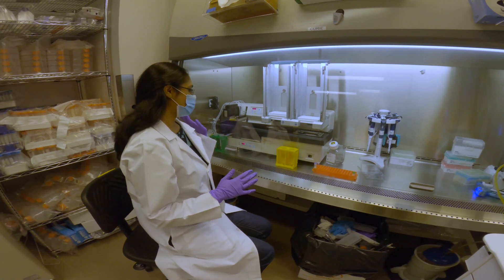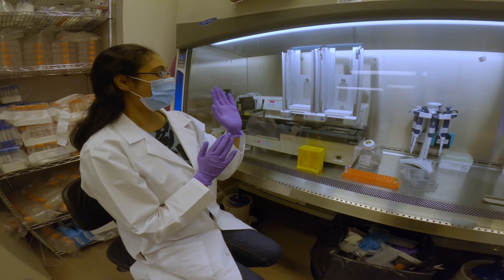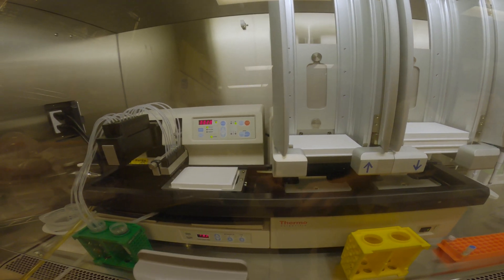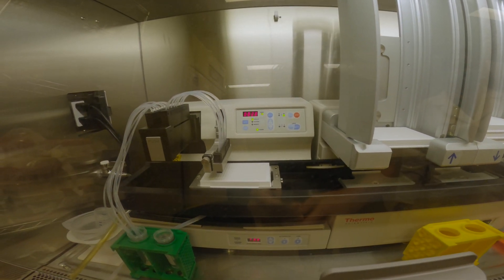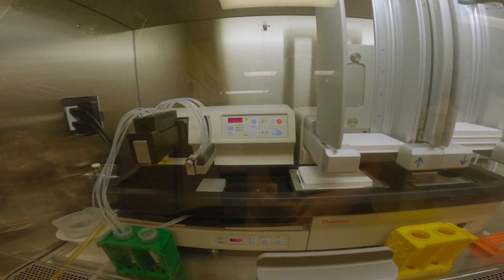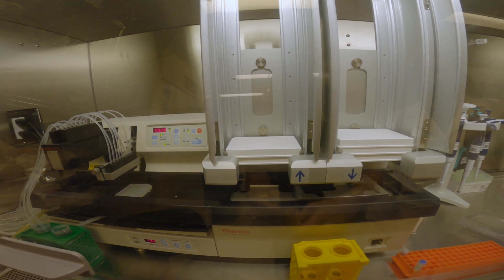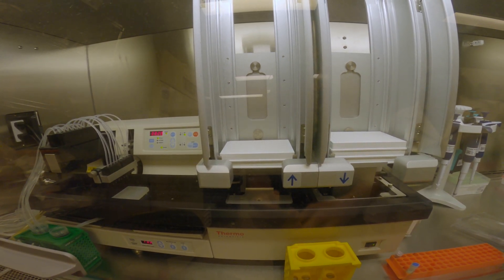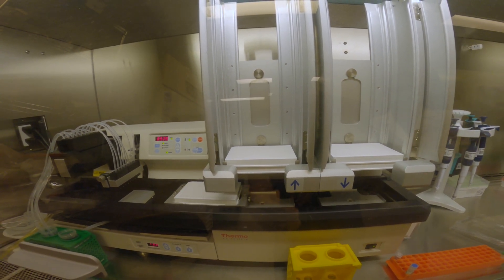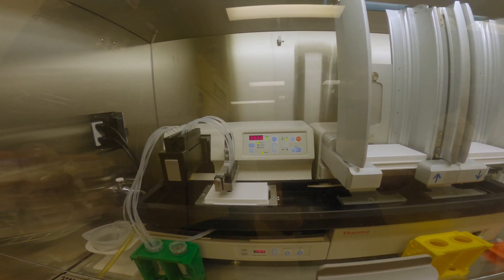Here we have our ViaFill Wellmate. Basically, this is a liquid dispenser, a liquid handle dispenser. We can stack up the plates here and have our liquid reagent that we want to output into the plates. The liquid handler will take the plate and dispense 20 microliters in each well. Once it's done, it'll put it back into the output stacker and continue until all plates are done. We use this for cell dispensing and lipid dispensing, allowing us to do about 30 plates in one setting.